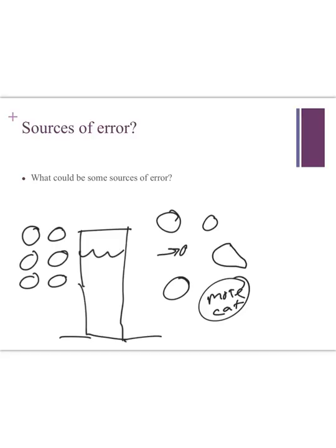And that is it. That is the lab for this week. So make sure that you have read over the section on enzymes, that you've gone over how temperature and concentration can affect an enzyme. You need to know what an enzyme is, what the substrate is, and what a product is. Also make sure that you understand what catalase is and how that plays into your yeast spheres.